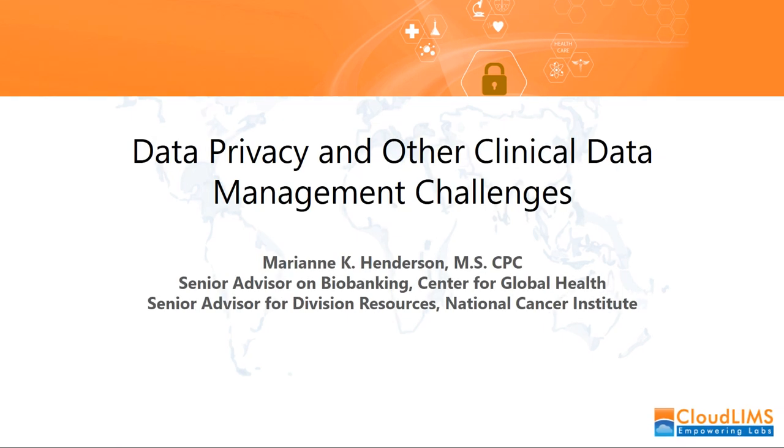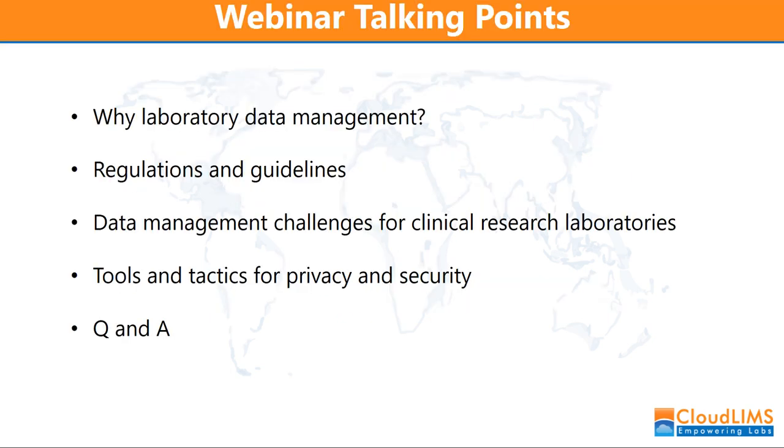Hello, I'm Marianne Henderson and I work at the U.S. National Cancer Institute. I'm glad you're accessing this webinar on data privacy and other clinical data management challenges. Today we'll focus on several areas: why laboratory data management is important, regulations and guidelines around data management, challenges for clinical research laboratories, and tools and tactics for privacy and security.